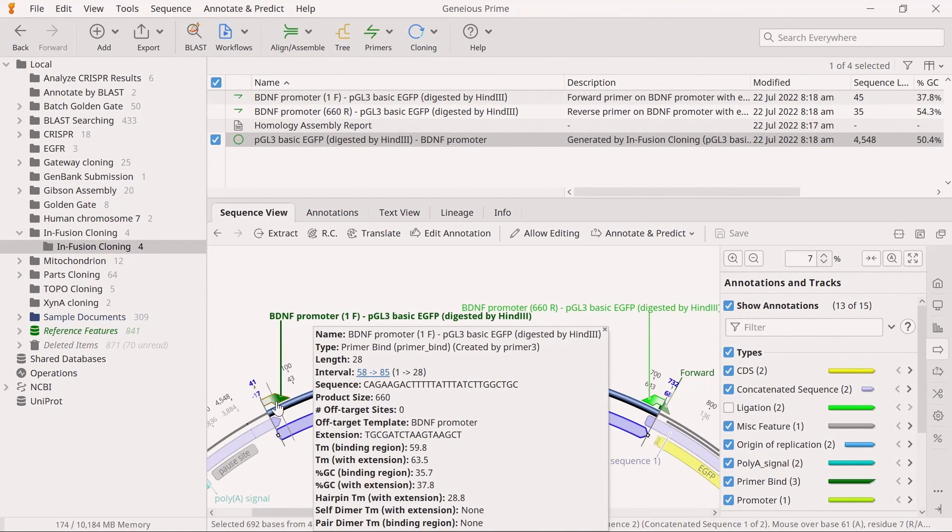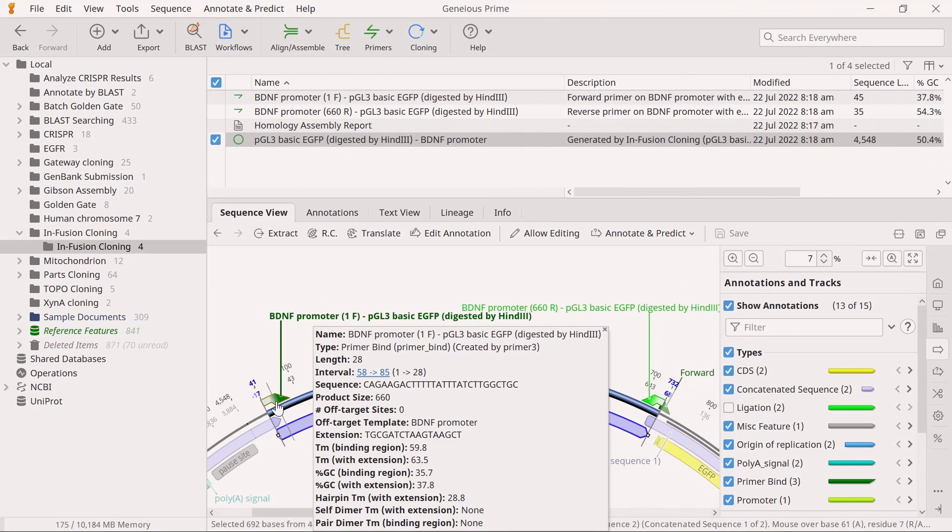You can also mouse scroll over the primer annotations to view the primer characteristics, binding sequence, and extension sequence. And that's how you perform infusion cloning in Genius Prime.